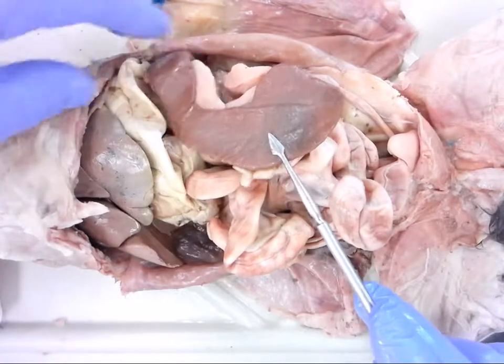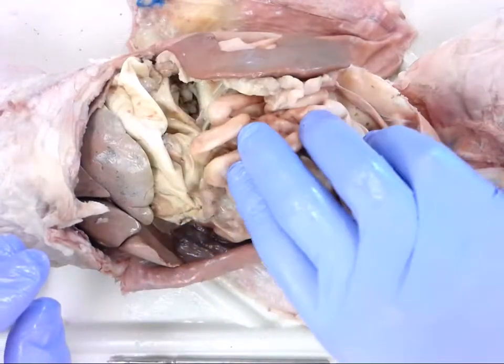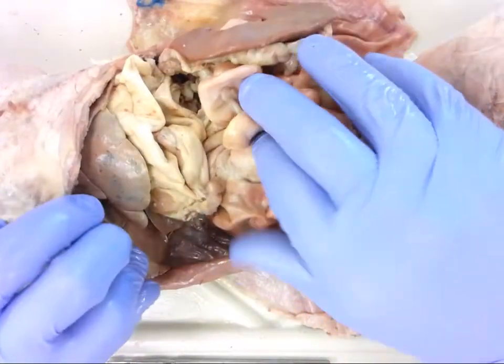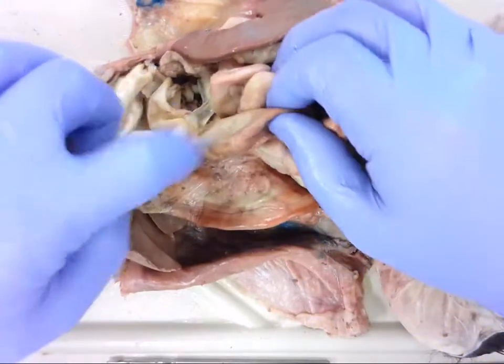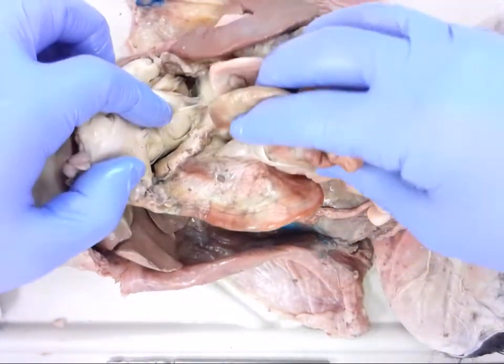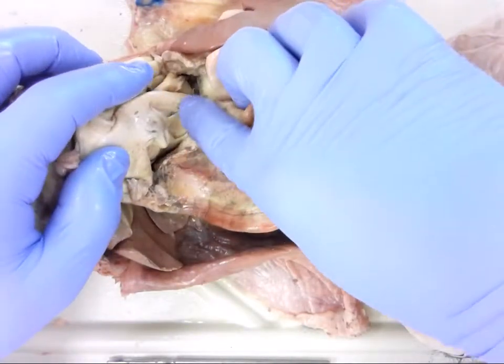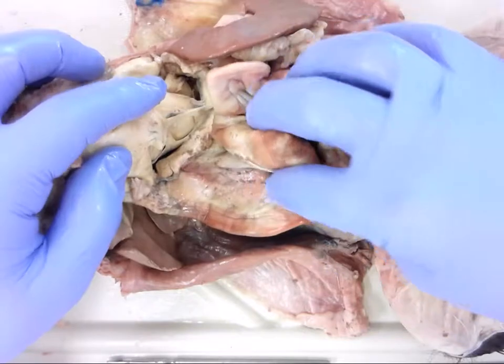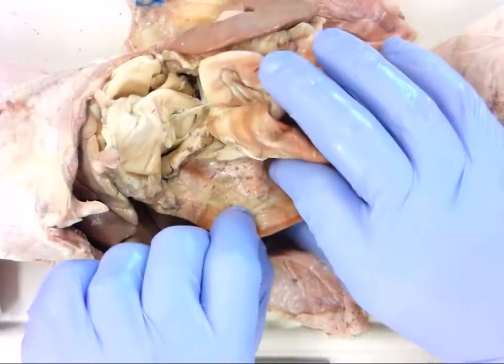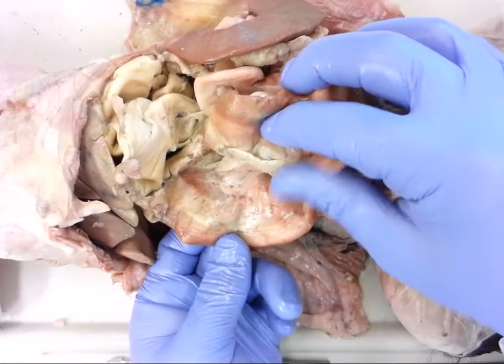Okay? The next one we are going to look at is the pancreas. Until you know what you're looking for, it's somewhat easy to miss. The pancreas is actually C-shaped. It runs right along the duodenum and the stomach. It's embedded within the mesentery, and it looks kind of like a spongy material.